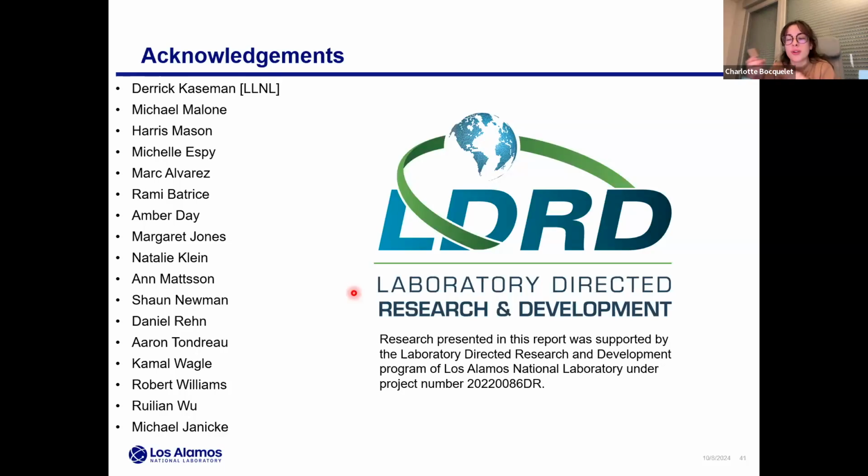Okay. And following this question, have you ever thought of combining this with hyperpolarization? Yeah, absolutely. Again, referencing what Megan Hulse has done with using DNP for Earth field NMR. I think in that case, their enhancement was sixfold compared to whatever their prepolarization field was. So I do like the idea of doing DNP since it's so simple, but there is a caveat: if you start doping in radicals, that's also going to broaden your line. So there's a trade-off in terms of how much SNR you want to get against resolution, as there always is.